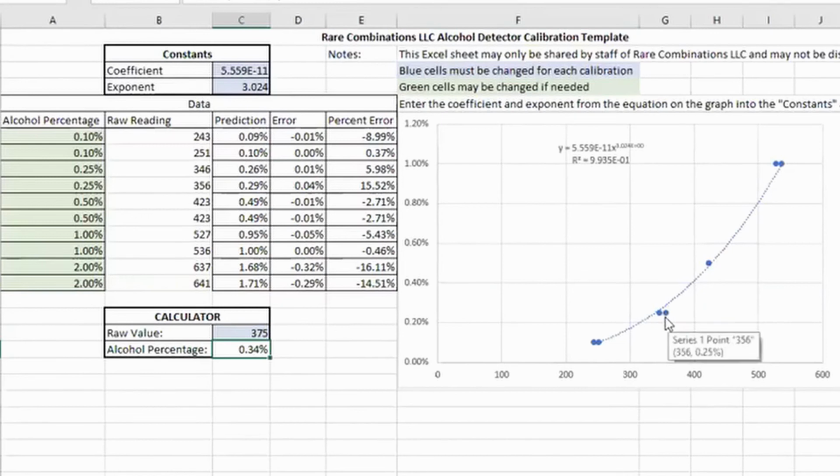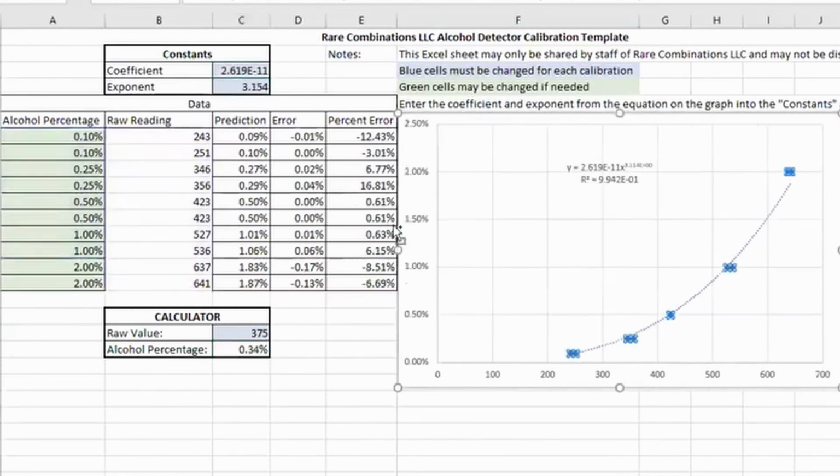So it's probably safe to say that we can press Control and Z and go all the way back. Actually, I went back a little bit too far. But yeah, the original equation that we had was pretty good. You can look at the graph and see that it gets pretty close to this 2% sample, and an estimation of 1.85-ish for a 2% sample isn't too bad.